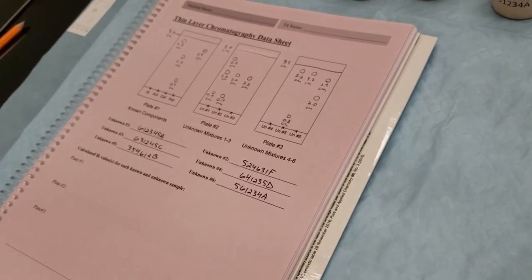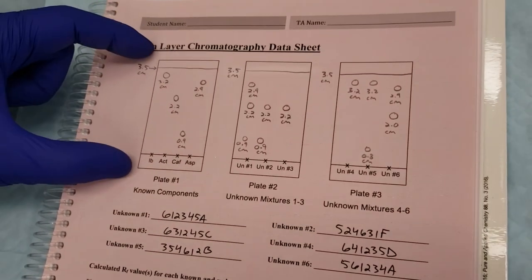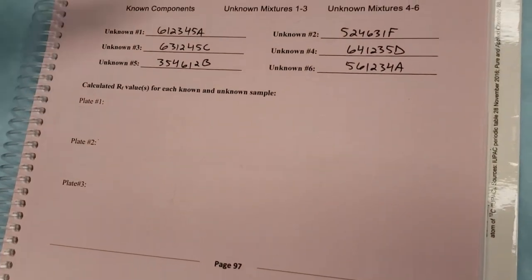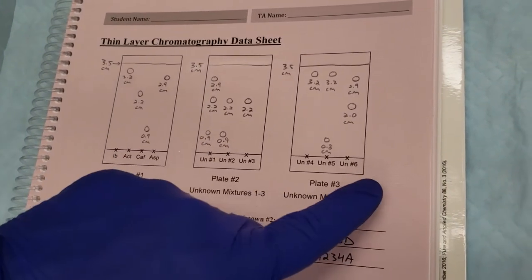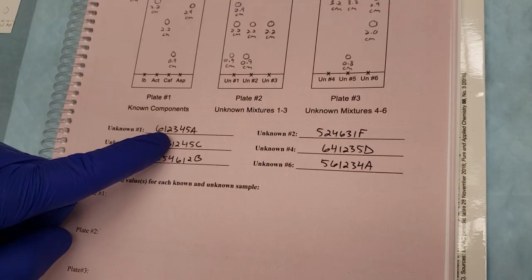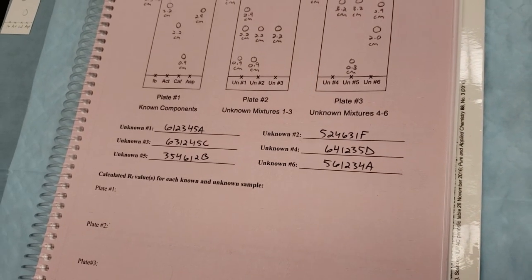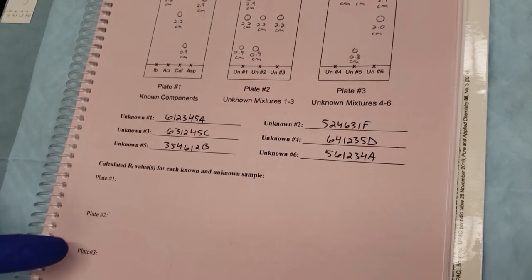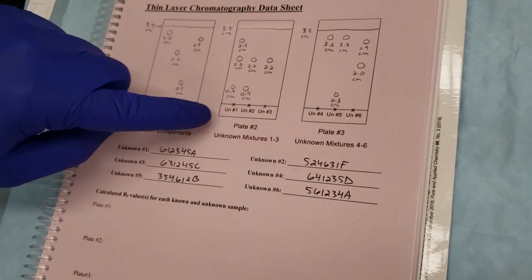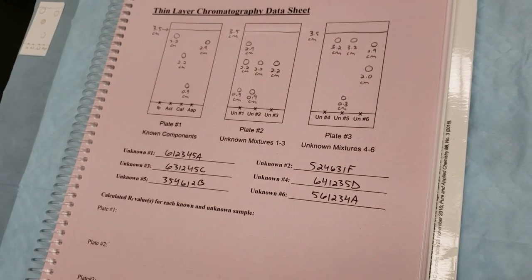So this is all the data that you'll need to calculate the RF values for your components. You'll place that in the bottom portion of your sheet here, for all 6 of your unknown mixtures that you're then going to identify using the table provided on the first page of your lab report. You'll write out the individual RF values here and here. Use that to identify the components contained within each one of these unknown mixtures. That's all you're going to need to write up your lab report. Good luck.